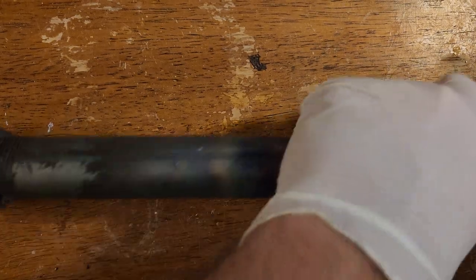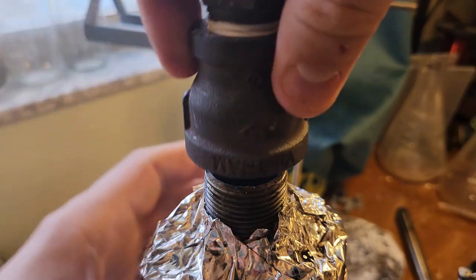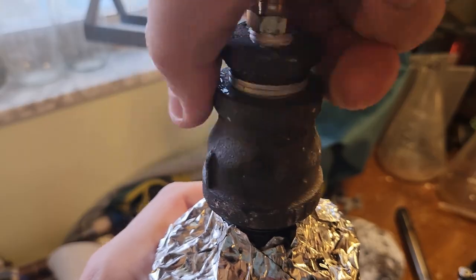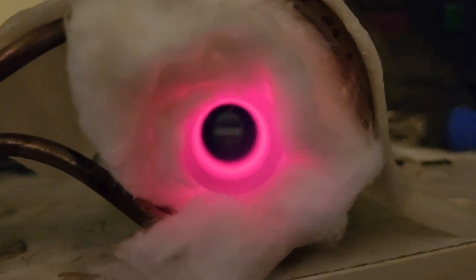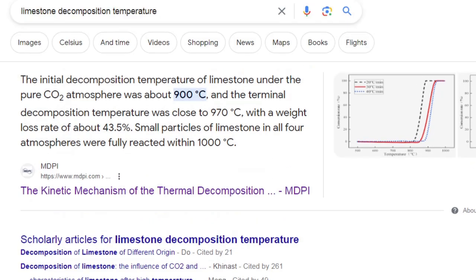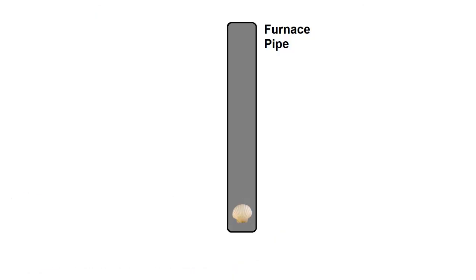I made a ZVS oscillator circuit to run off 48 volts with a copper coil as the induction coil. This one-inch pipe will be the furnace that gets heated up with the seashells inside. A cap with a flare fitting adapter will be screwed onto the top to seal the pipe, and the flare will attach to a hose for gas collection. A quick test run shows it has no problem getting the pipe red hot — according to the incandescence chart, that color should be around 900 to 1000°C, which should be hot enough for the limestone decomposition.